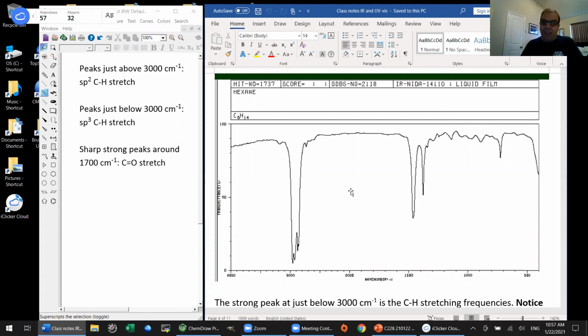But again, this is not about memorizing particular spectra. You might be able to tell it is cyclohexane and cyclopentane. Yeah, and of course, cyclopentane is just a teeny bit more strained than cyclohexane. It would be interesting to look those up. I wonder what cyclobutane and cyclopropane would be if this website has those spectra.